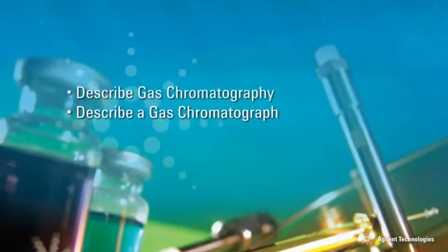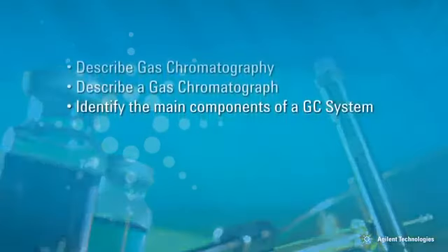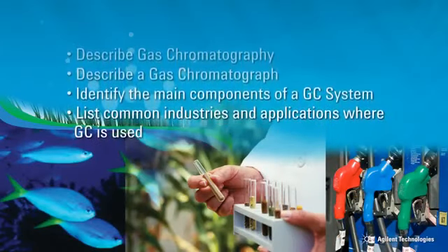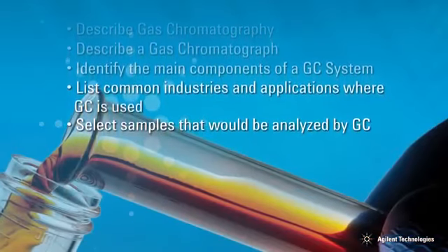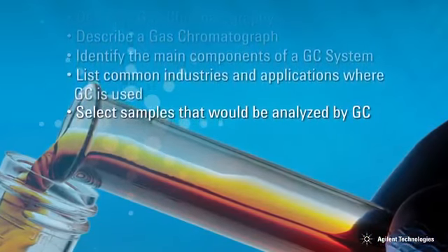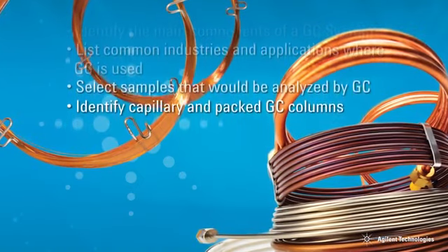Completion of this introductory training module on gas chromatography will prepare you to describe gas chromatography and a gas chromatograph. Identify the main components of a GC system. List common industries and applications where GC is used. Select samples that would be analyzed by GC.